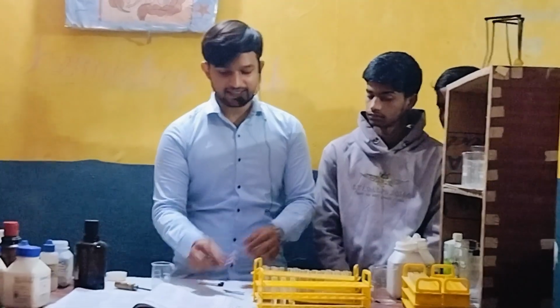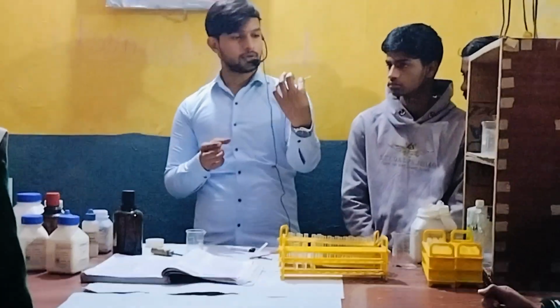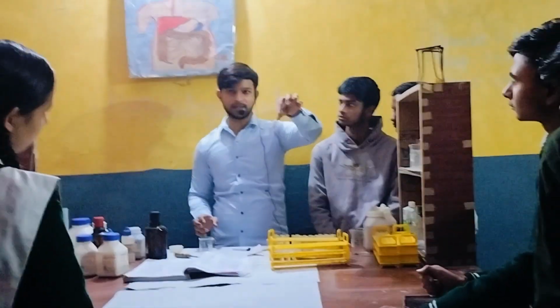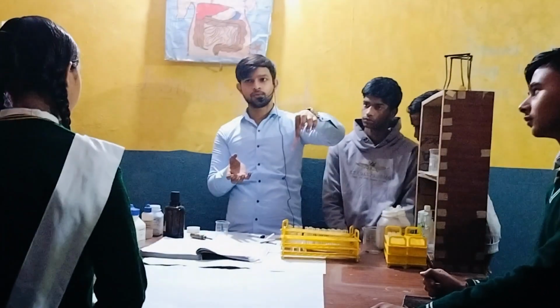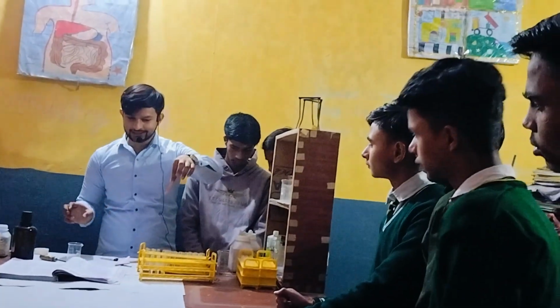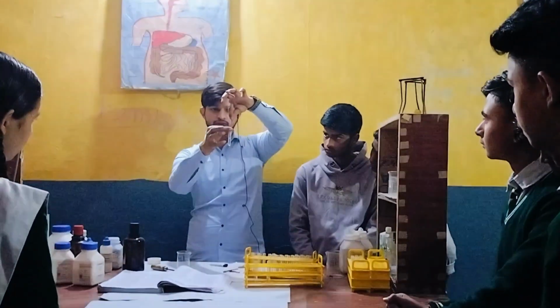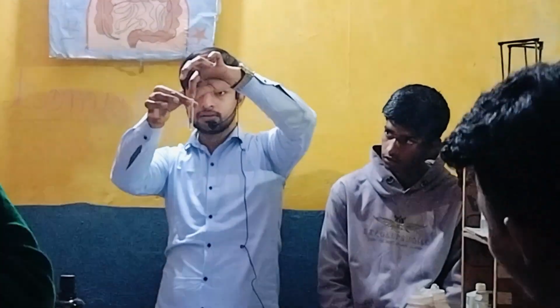Okay, so let's take one red litmus paper. Okay, this is red in color. Can you tell me if I dip this paper into base, then the color will change into blue. Blue. Red litmus will change into blue if I put it into base. So please see, please zoom it out again. Now see, can you see the blue color? Now see, blue color? Yes, sir. Yes. So it confirmed that in this test tube there is base.